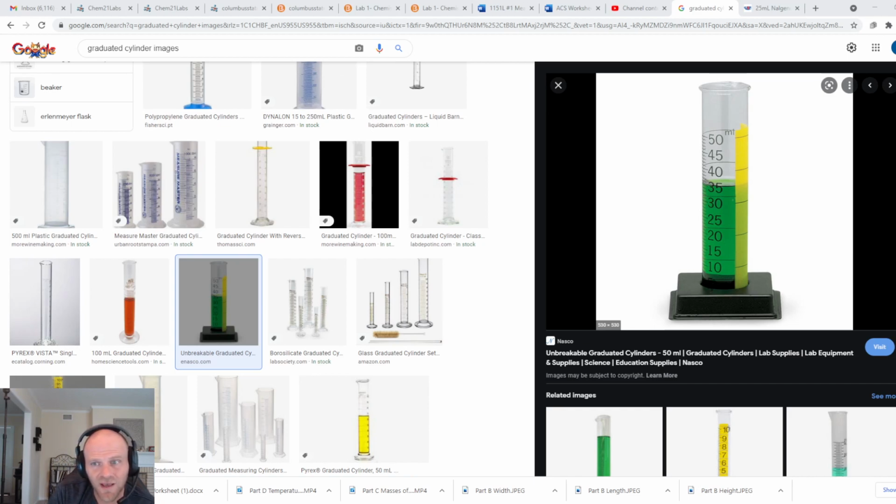If it were a little bit higher, I might call it 35.5, but either way, you're always going to get that one extra significant figure, whether you're talking about on a ruler or in a graduated cylinder or in a burette, which you haven't seen yet, but we'll talk about later. Okay, so that's the estimated digit. The last one that you see of a measured number is always the estimated digit, and you can just assume that we've estimated there because, as I said, measurements can always be more precise.